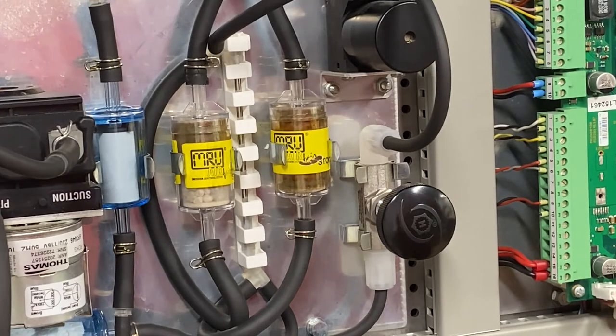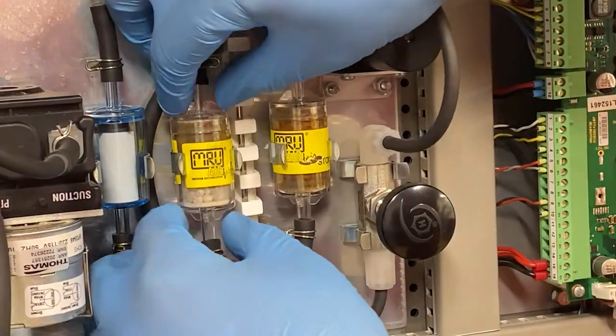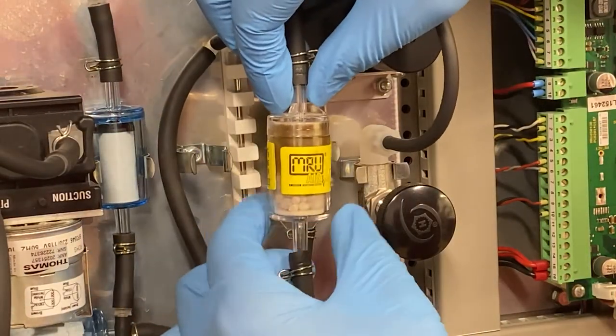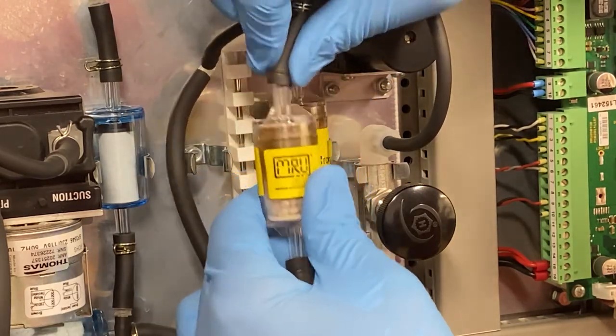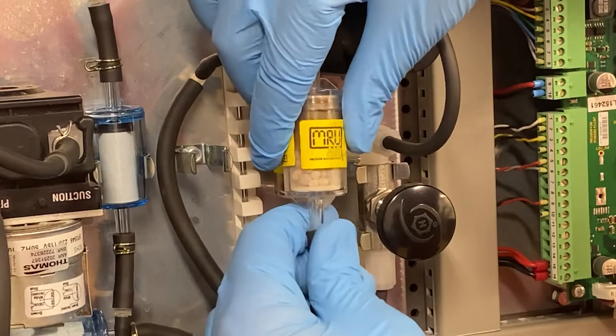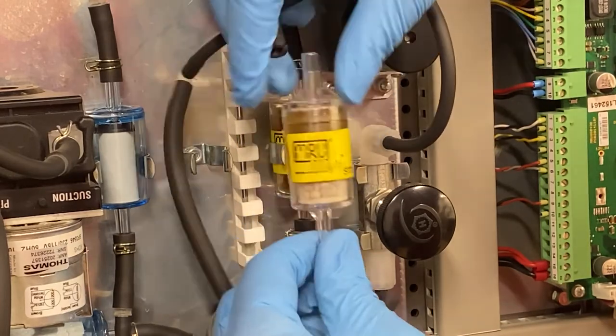To remove the used filter, first unclip it from inside the device. Then unfasten the metal clasps on both the top and bottom. And lastly, remove the tubing from both sides.